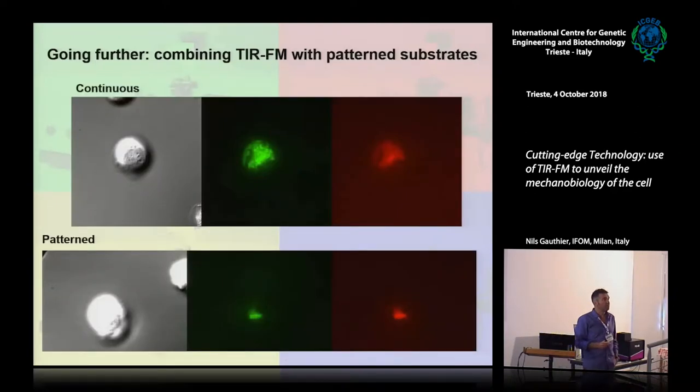And finally, because of the micropatterning, you can have a more precise idea of which molecule is important for adhesion and which molecule is not. For example, I put those two movies.